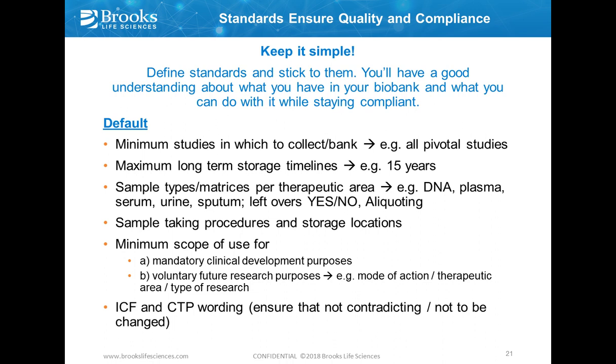So how can we best reach that without being too complicated, without having to do too exhausting reviews of our ICFs, and to keep control over all of our samples and studies, which come from different places and are stored at different places, maybe as Kathi lined out before. So my slogan would be, keep it simple. Work with standards and stick to them. You will have a good understanding about what you have in your biobank and what you can do with it while staying compliant. And the standards I propose here are pretty simple.